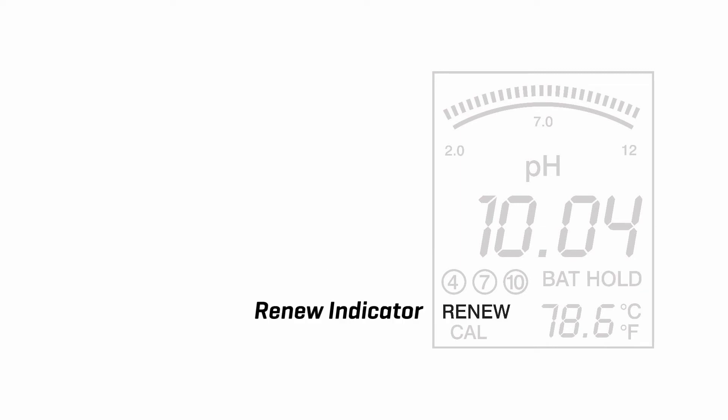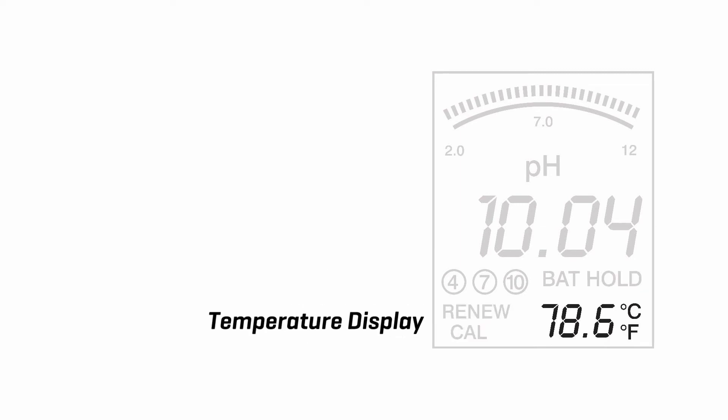Data hold indicator. Renew indicator. Cal indicator. Temperature display.